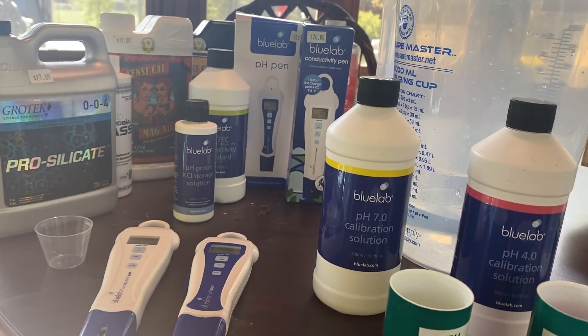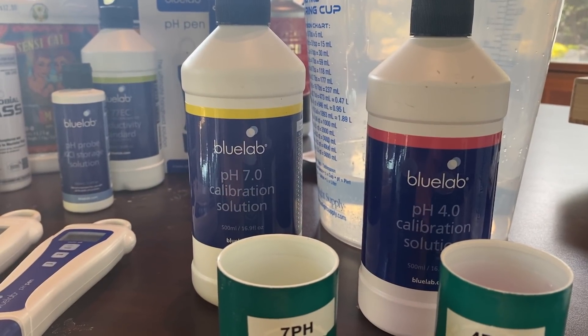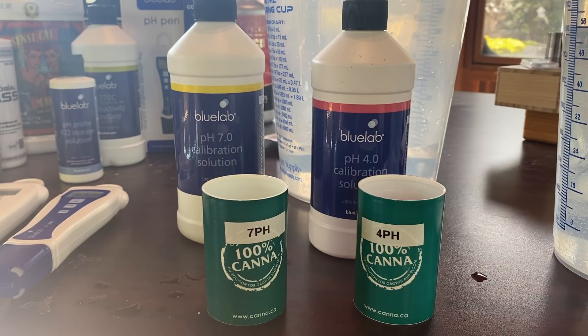What's up guys, Super Smoker here and today we got a quick video for you on how to calibrate and maintain the Bluelab pH pen. First thing first, we got two cups in front of us — one labeled 7 pH, the other labeled 4 pH. I've already gone ahead and filled them up with the solutions provided by Bluelab.